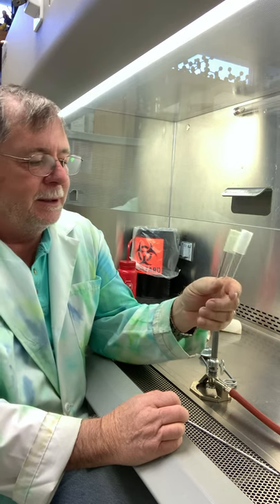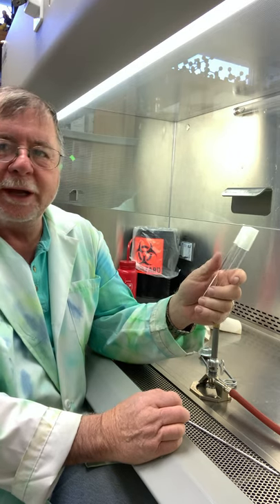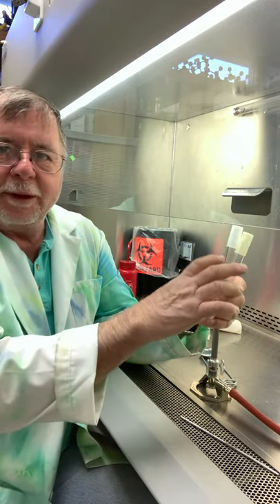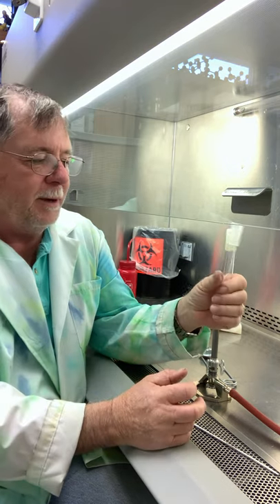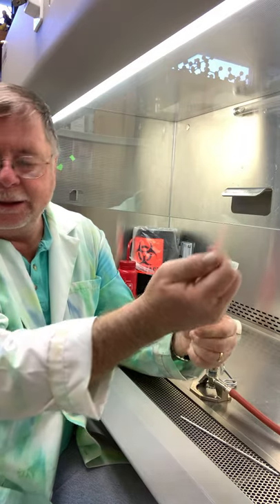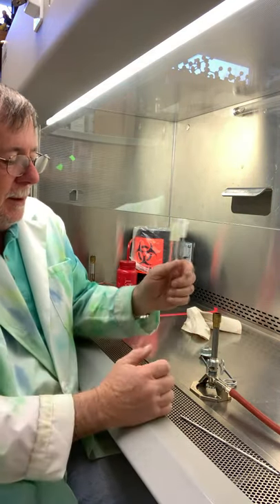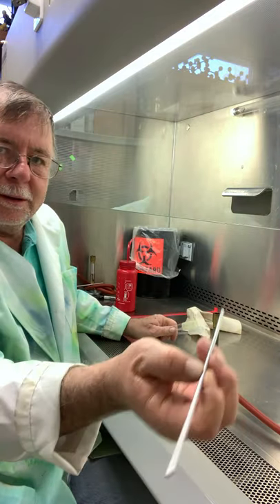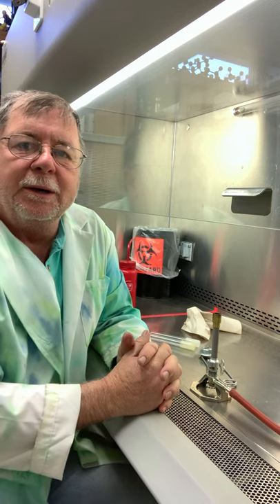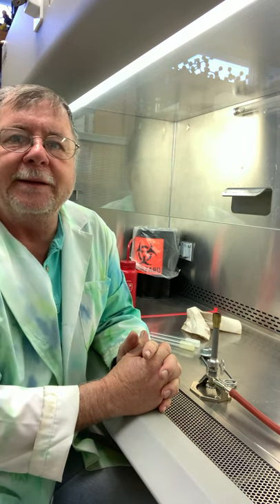You can practice at home with a couple of tube-like structures, like a couple of Sharpie pens, and roll them around. Practice taking the cap off the Sharpie pen, practice flaming, and get your loop, all that. So you want to do a dry run simulation just like you were doing it for real, okay? All right, that's it, thank you.